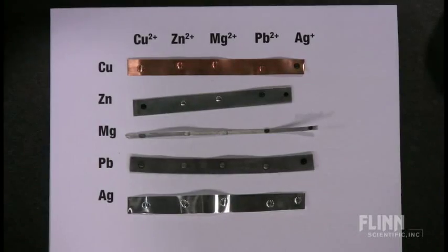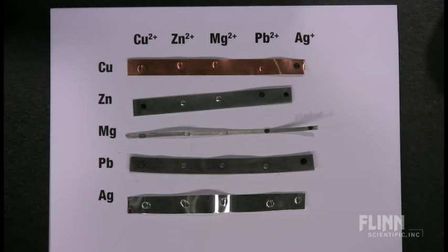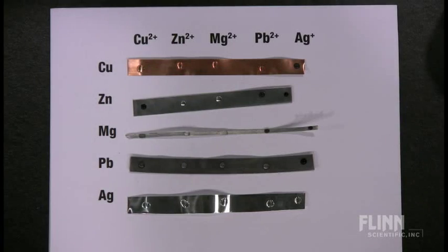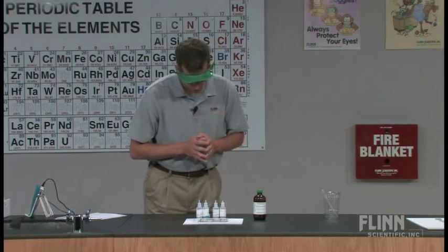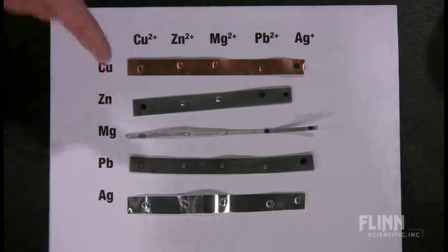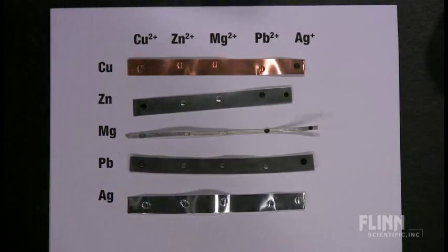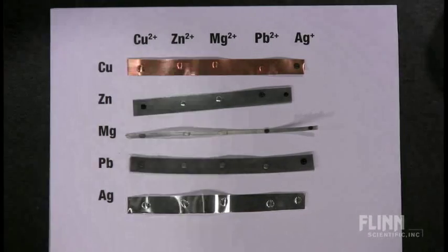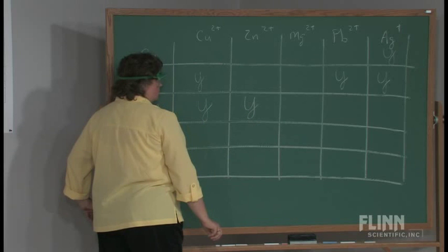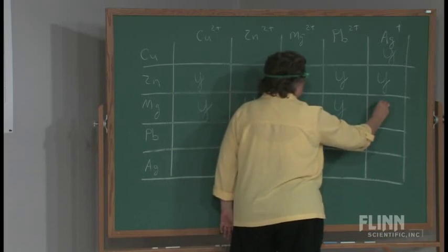In the next row across with the zinc metal, I see a reaction taking place with copper(2+). The next two are skipped, and the next one reacting is the lead(2+) and also the silver(1+) ion. With the magnesium strip, I'm seeing a little bit of copper(2+) settling out. I'm seeing a little bit of bubbling on the zinc — not much precipitate, but a little reaction going on there. I'm seeing none with the magnesium, and a yes with the lead and a precipitate with the silver ion.